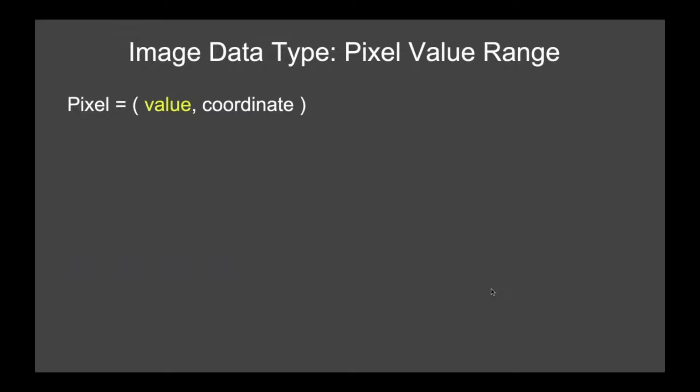Okay, another very important technical thing about images is that they also have a data type. And so basically these values of the pixels, they are limited. They cannot take all values. So for example, you might have heard of 8-bit images, or it's also called unsigned byte images. So they can only take integer values starting from 0, 1, 2, 3, and then the maximum value 255. Which is actually 2 to the power of 8 minus 1, and that's where the 8-bit comes in.